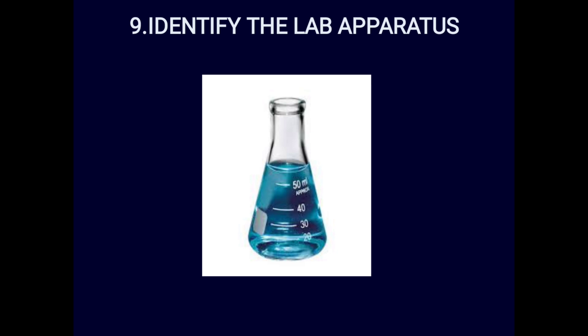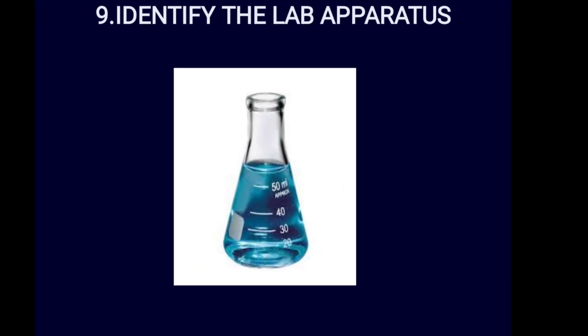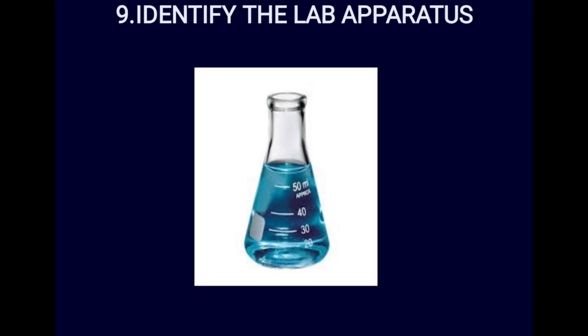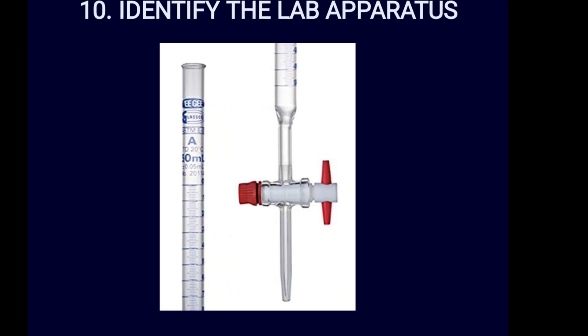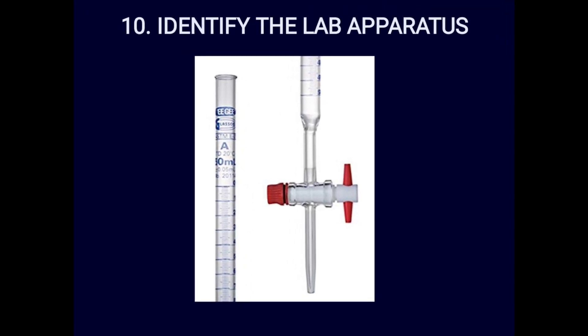Spotter nine: identify the lab apparatus. This is a conical flask — cone-shaped with graduation markings. It is usually used for titration such as acid-base titration. The answer is conical flask. Spotter ten is a burette, also used in acid-base titration.